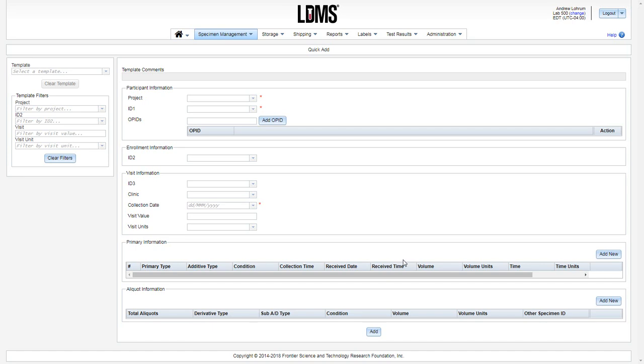This video tutorial will cover the use of QuickAdd for specimen entry in WebLDMS. If you participate on a clinical trial network that utilizes preloads or templates, please review that video.